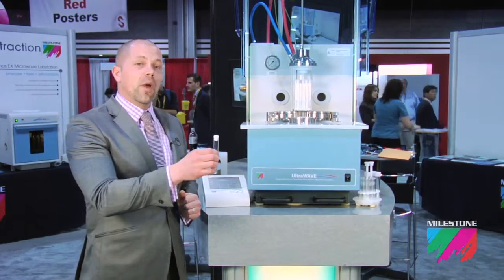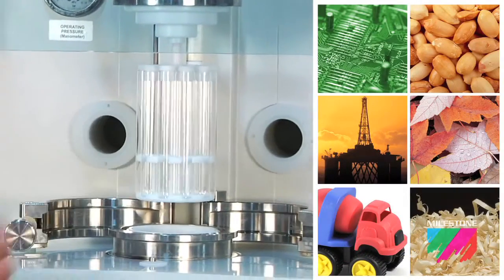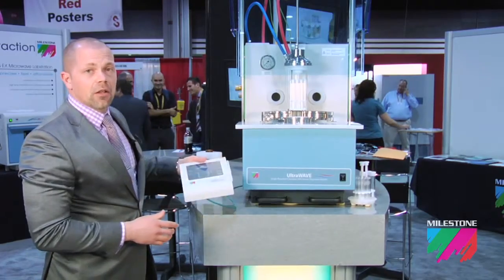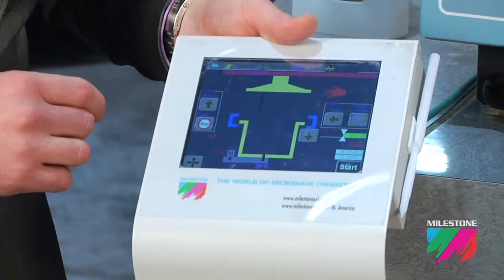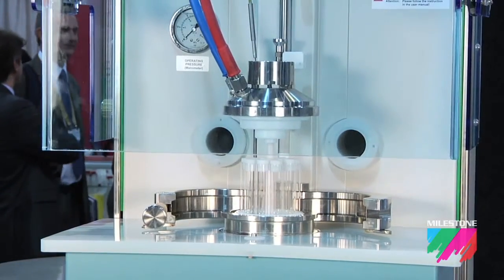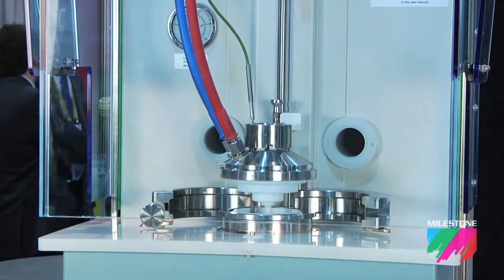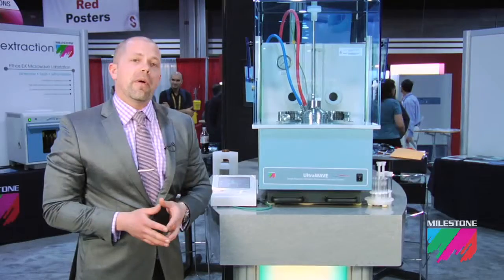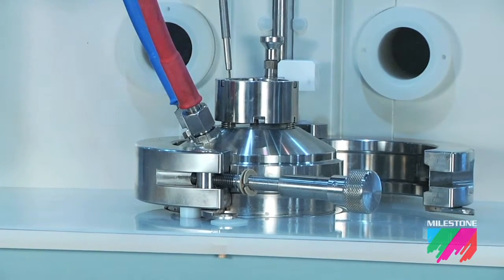Once the sample is weighed into the digestion vessel, the vessel is placed into the sample holder and the rack is lowered into the digestion chamber at the press of a button. Prior to the start of the microwave program, we secure the rack with two stainless steel clamps.